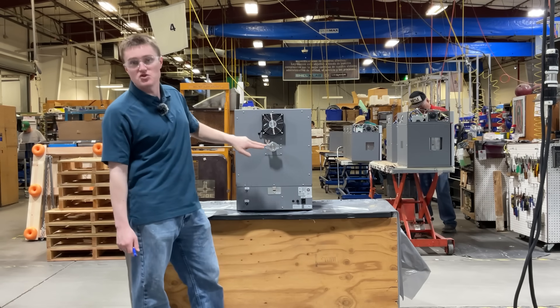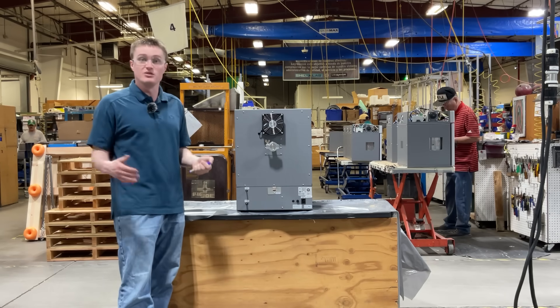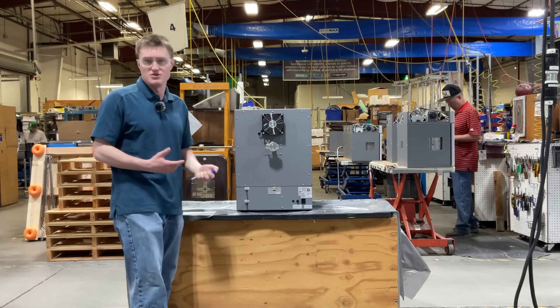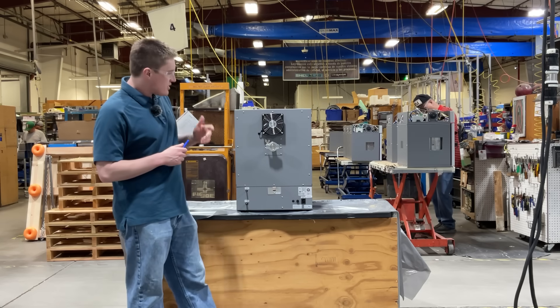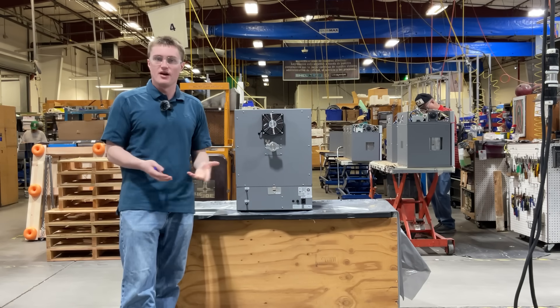Next, we have a KF-25 fitting. This allows the user to pass anything they would like through this fitting — most folks use it for cables. Last, we have a circulation fan that helps keep even heat distribution around the chamber.